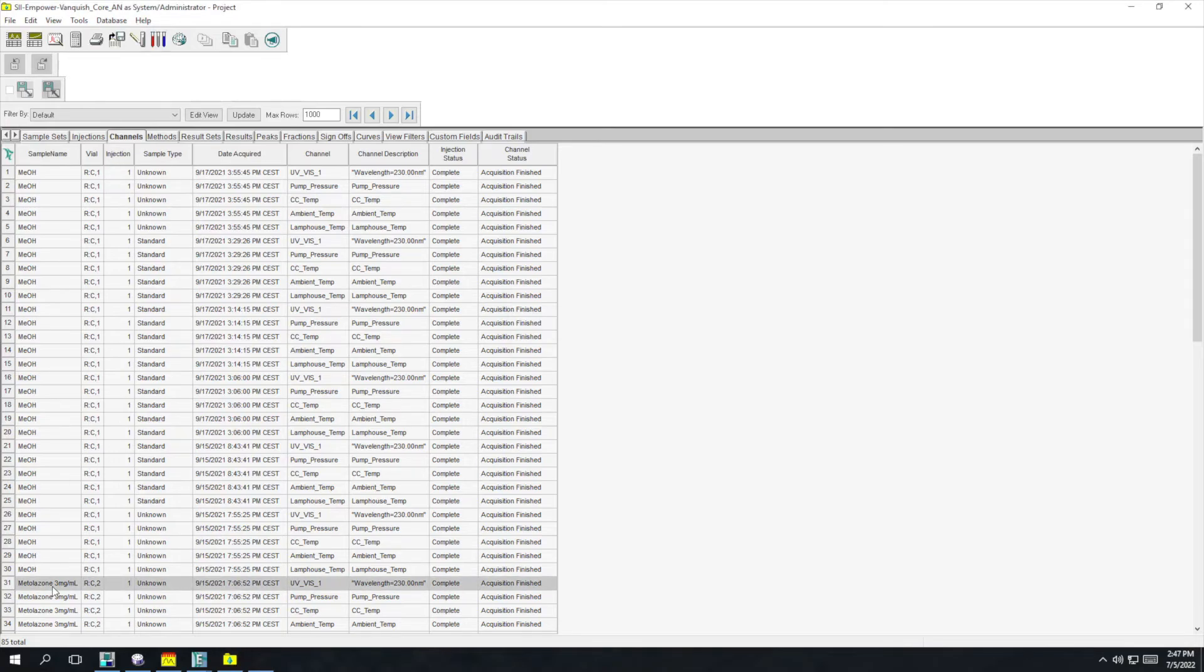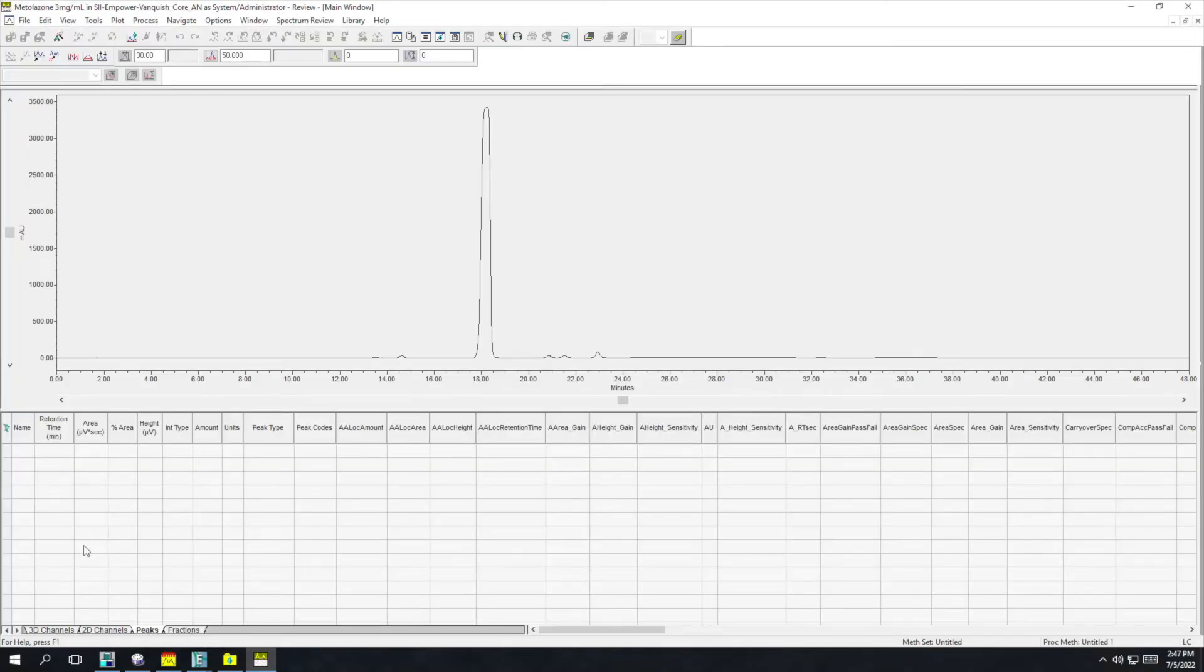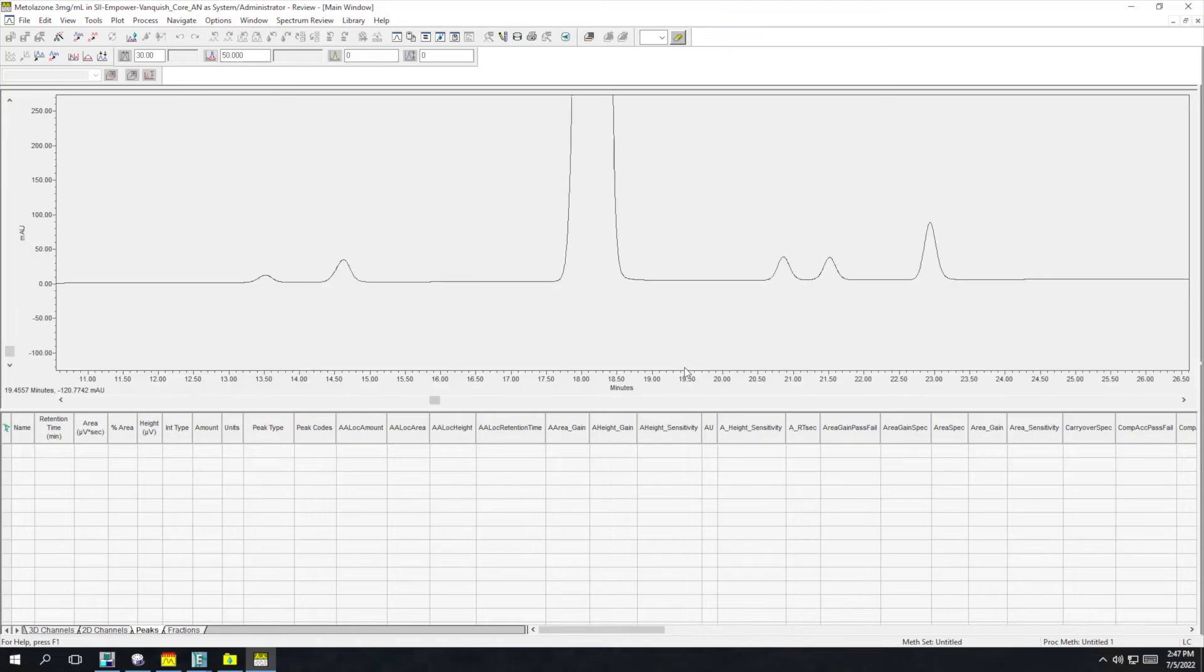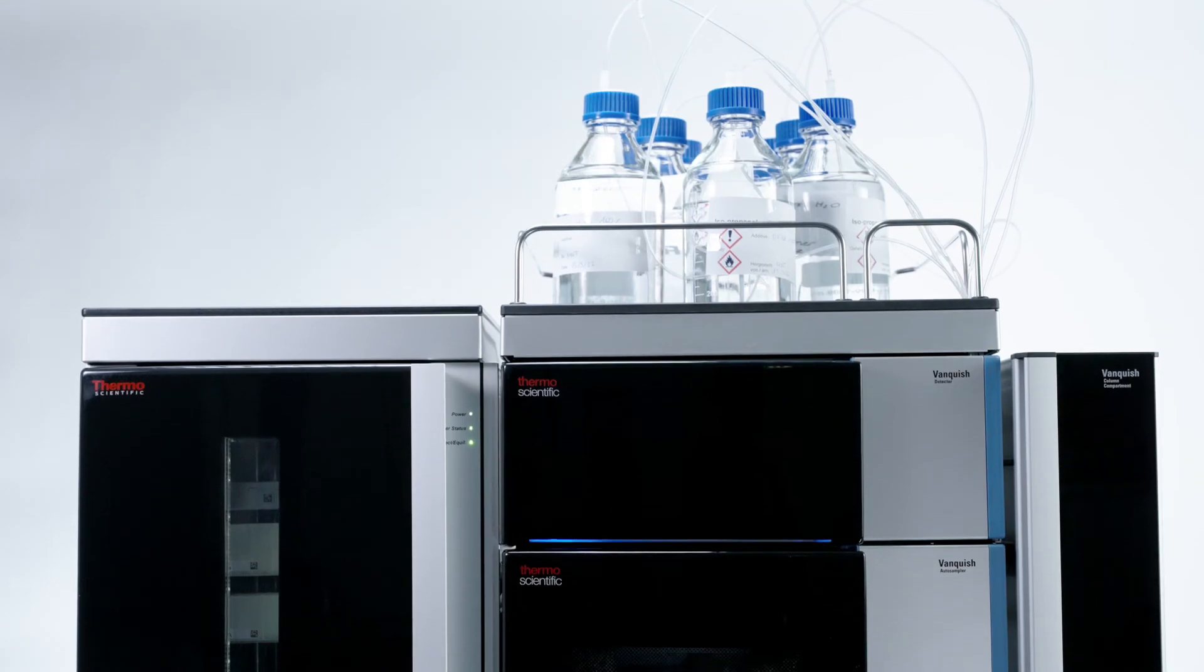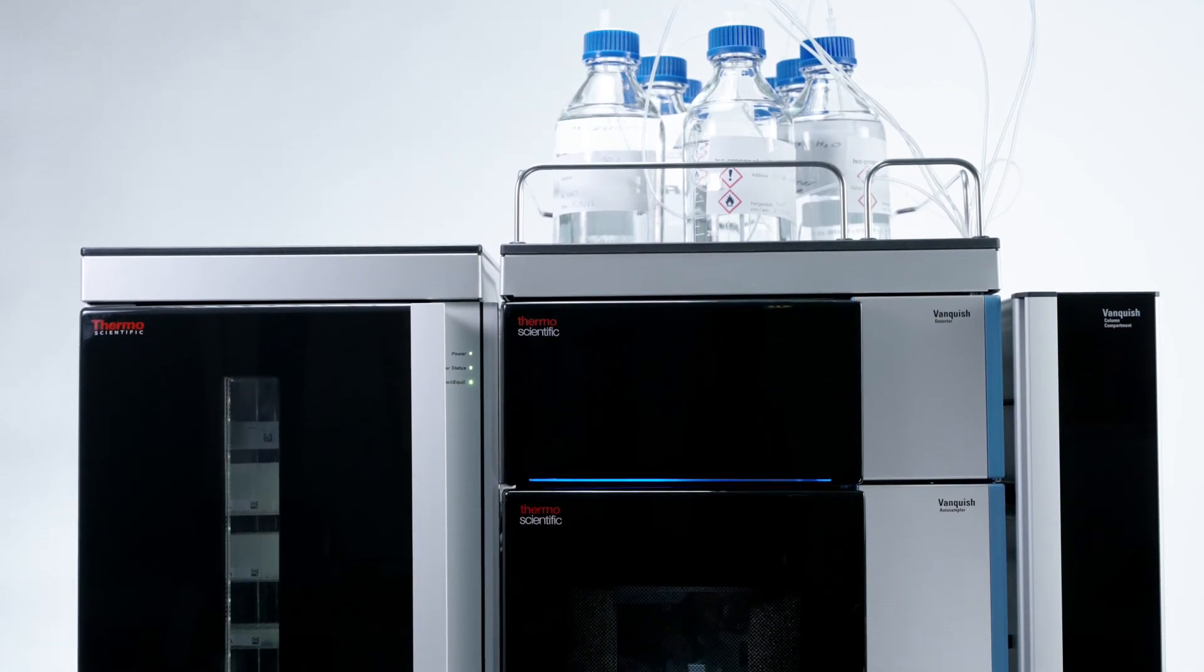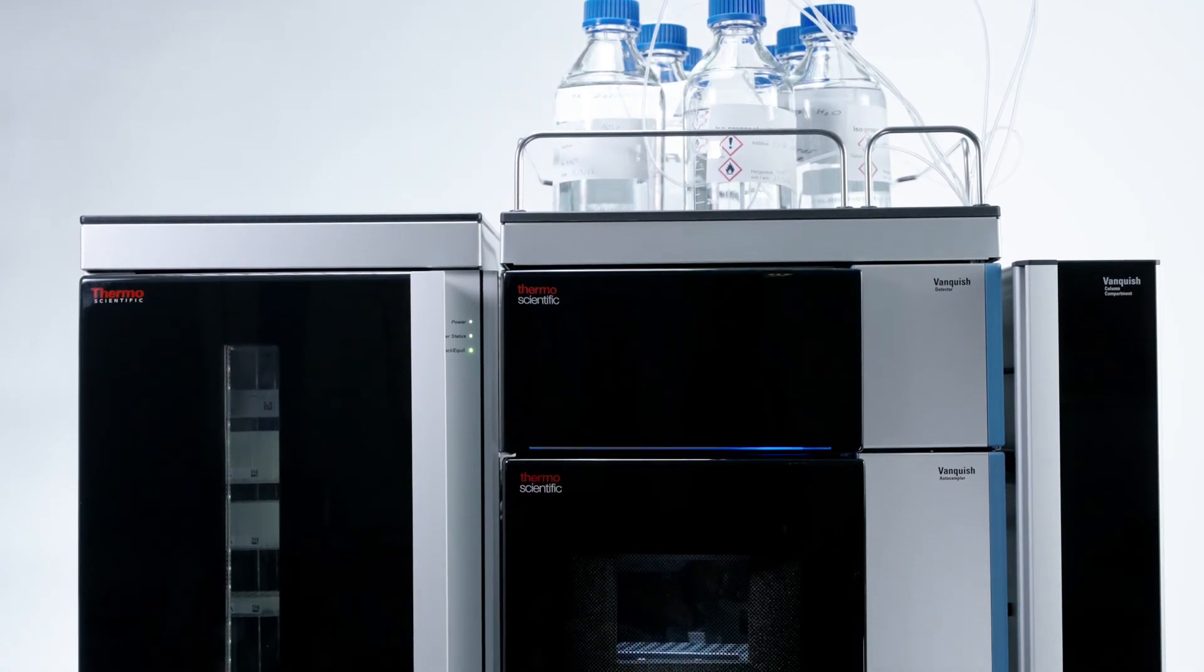For labs standardized on another CDS, the Vanquish Horizon system can easily be controlled using a third-party CDS. Choose an instrument that takes your science further than ever before. The Vanquish Horizon UHPLC system. Unparalleled performance.